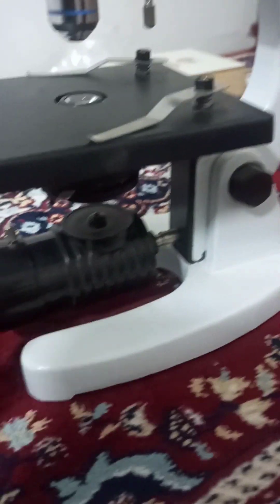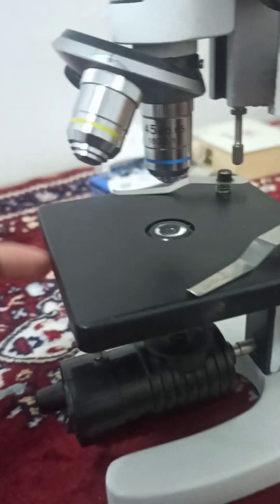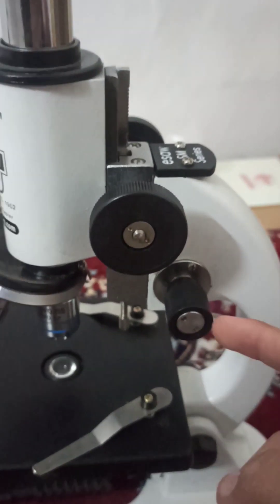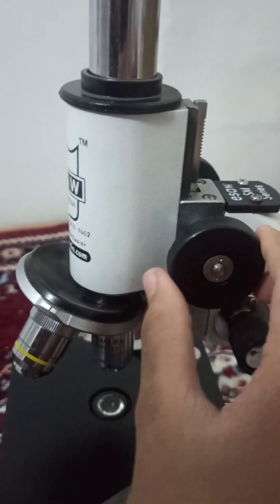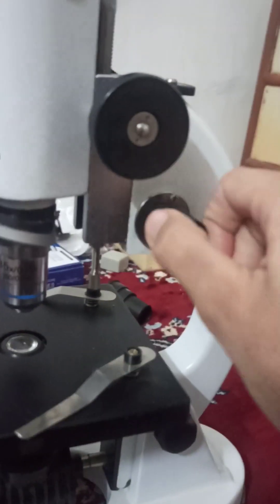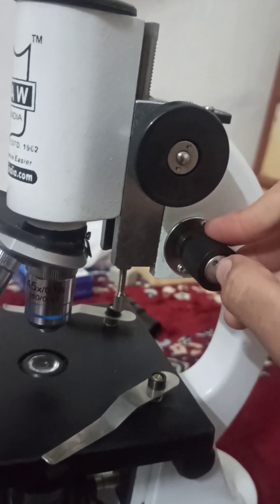Either the LED light or the mirror that came with it has to be fitted in here — this is to provide a light source so that the slide is visible clearly. It also contains two knobs: this one is the coarse adjustment knob, which makes very noticeable movements.